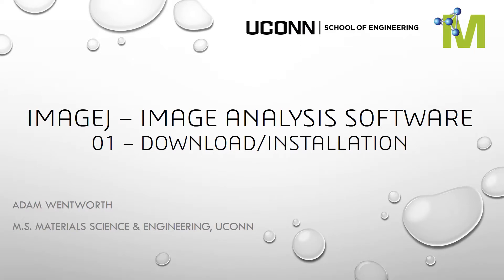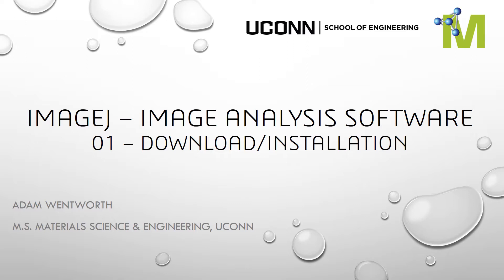Hi, welcome to the ImageJ tutorial. This first segment is going to show you how to download and install the software. ImageJ is free software and is available for Windows, Mac, and Linux operating systems, so you should have no problem doing the download and installation. This tutorial will be just for a Windows operating system.